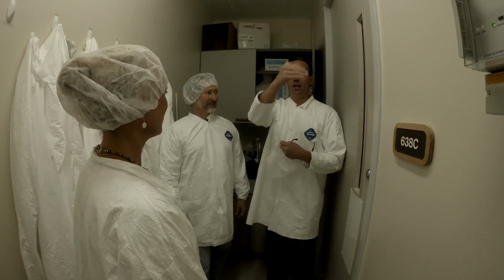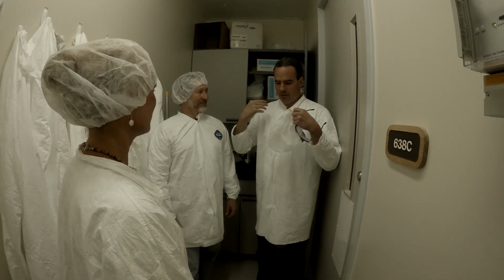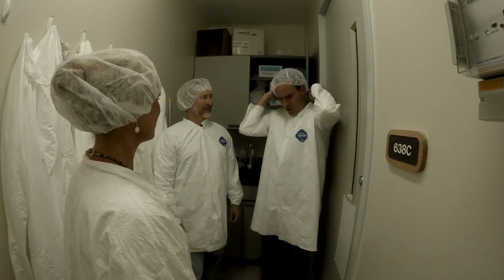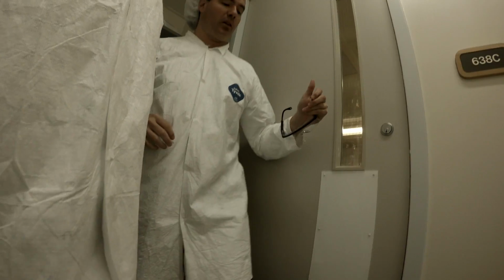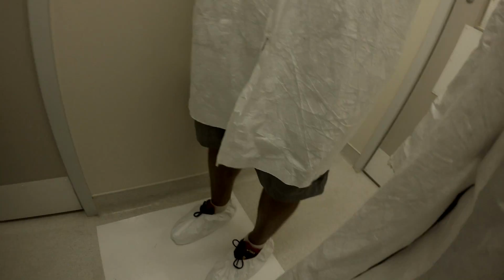So, there's a line past which we do not wear shoes. Then once we come in here, we always gown up and get ready in this room before heading in there. And we always be sure to step here on the sticky mat so that whatever particles are on the bottoms of our feet and of our booties get taken off, and so that we don't take them into the lab.